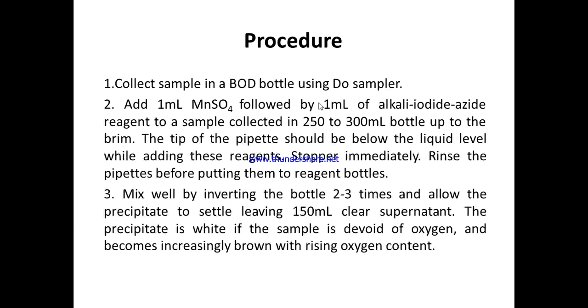हम 1 milliliter MnSO4 ऐड करते हैं, 1 milliliter alkali iodide azide उसमें ऐड कर देते हैं. अब brownish color will develop. We will let it remain for 30 to 40 minutes. 30-40 मिनट तक उसको हम undisturbed condition में छोड़ देते हैं. And we close the cap also. बोतल बंद करके छोड़ देते हैं अच्छे से एक बार मिक्स करने के बाद.